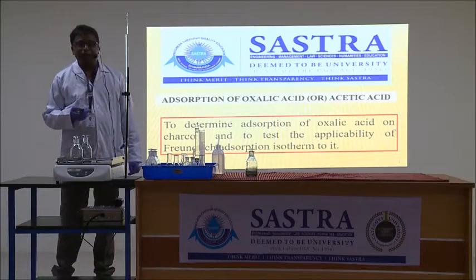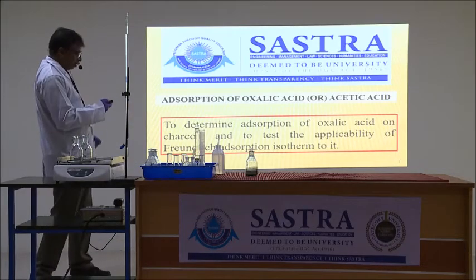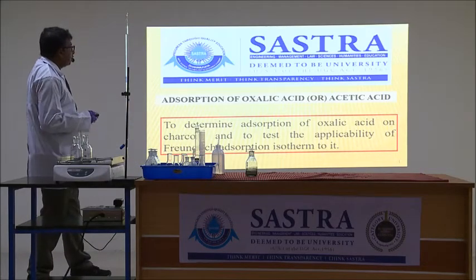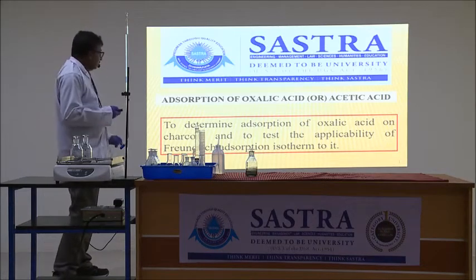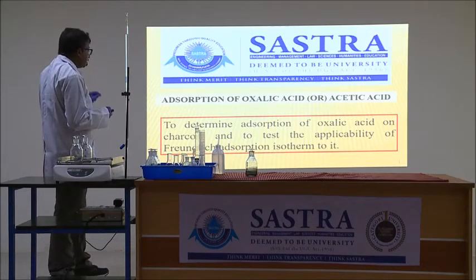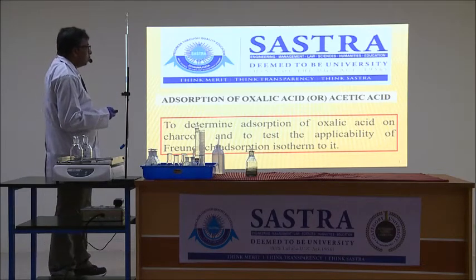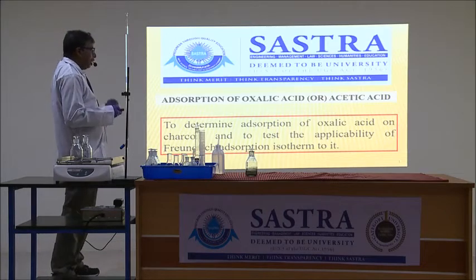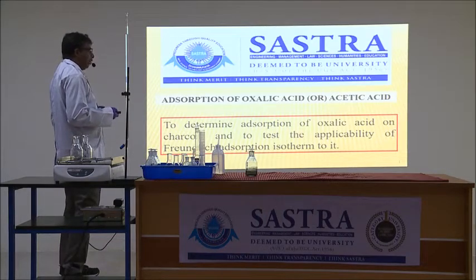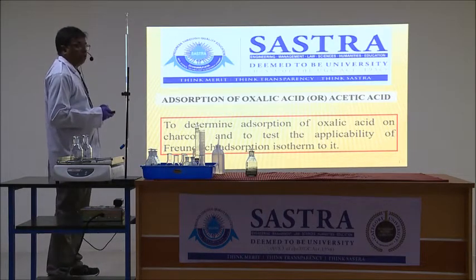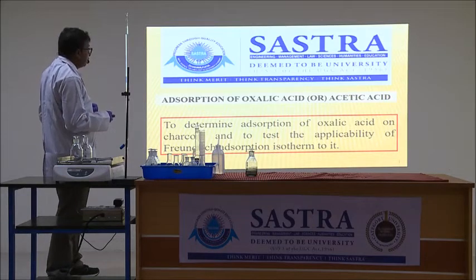This is Dr. Tughin Project. I am going to demonstrate the experiment of adsorption of oxalic acid on charcoal surface. The aim of this experiment is to determine the adsorption of oxalic acid on charcoal and to test the applicability of the Freundlich adsorption isotherm to it. Let us go into the experiment.